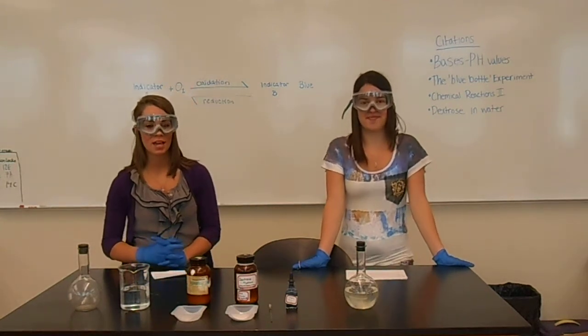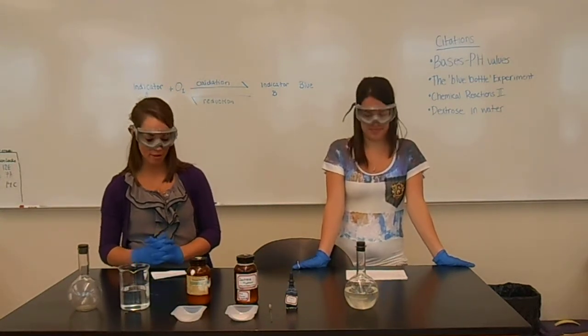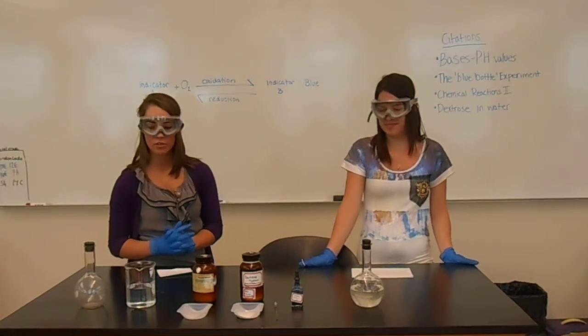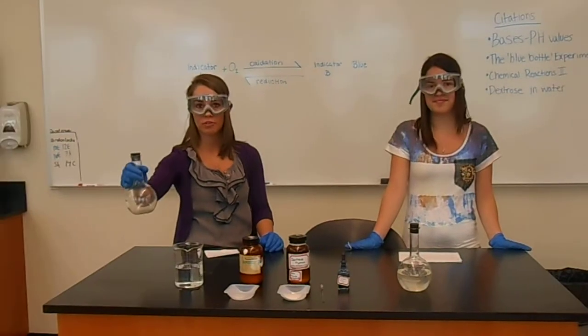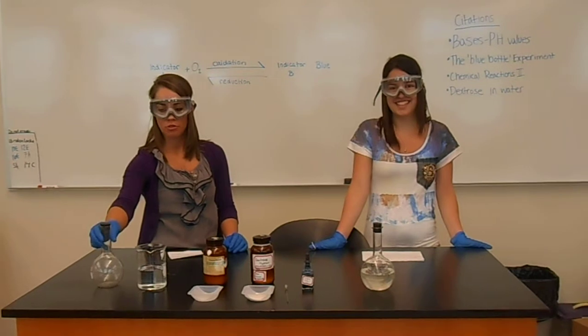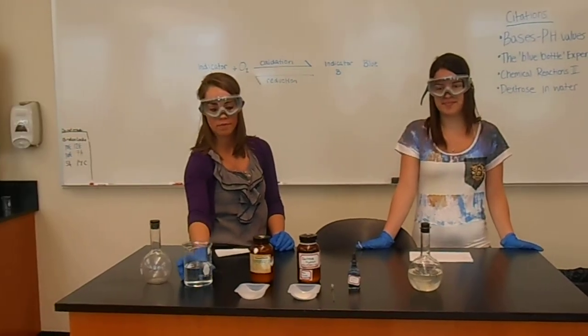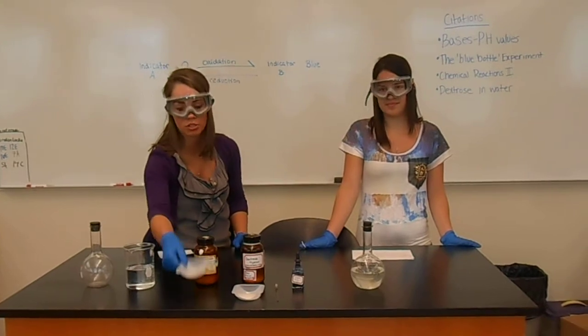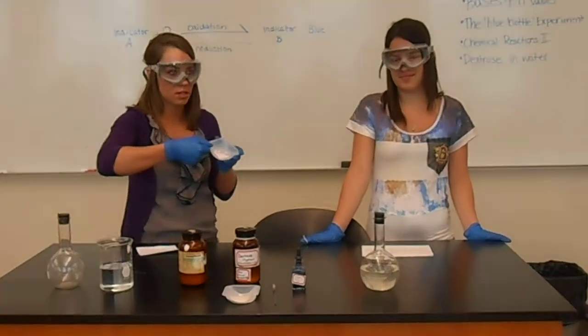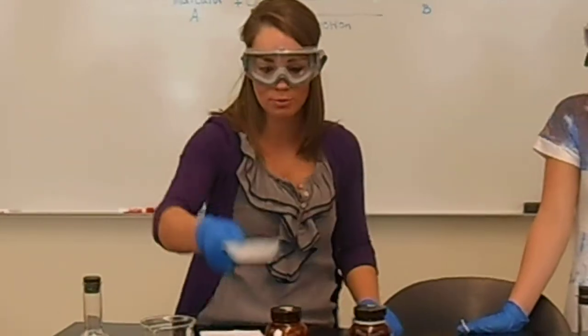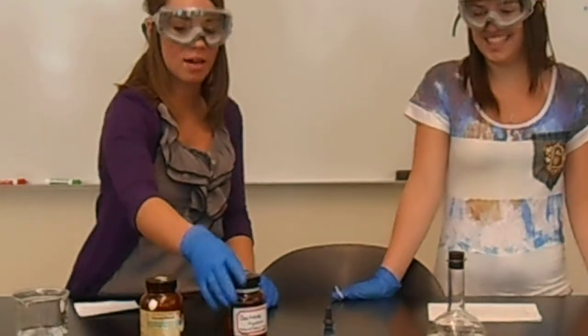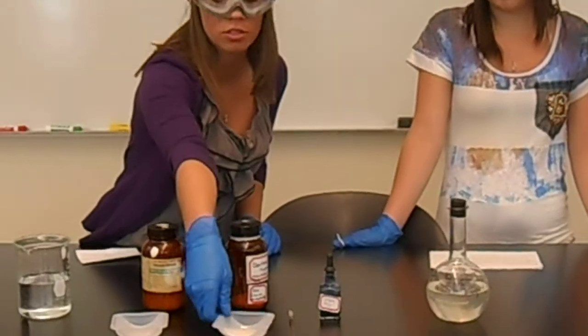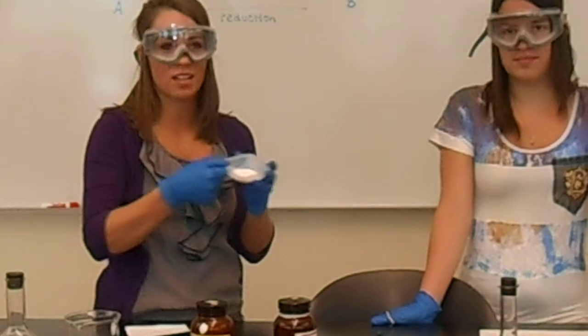I'm Tori and I'm Alexis, and we're doing the methylene blue traffic light. Materials you will need: a flask with a stopper on top, 300 milliliters of distilled water, 8 grams of potassium hydroxide which looks like these little pieces, and then you have 10 grams of dextrose which is white and sand-like.